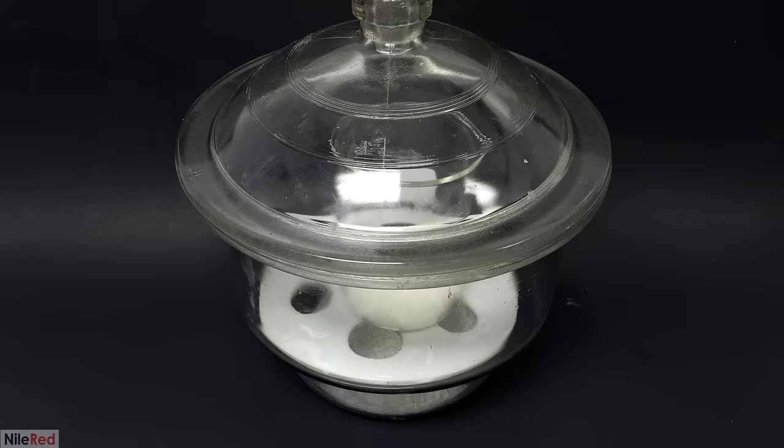Now before I go, this is just one last thing that I wanted to show, which I think is pretty cool. This is a photo of the solid MOED and you can see that it's both red and blue at the same time. I think this is because as it crystallized, it did so in both the A and B form, which reflect light differently. Anyway, I think that's about it for this project. I honestly had a lot of fun messing around with the MOED and in the future, I definitely want to try making some other solvatochromic chemicals.